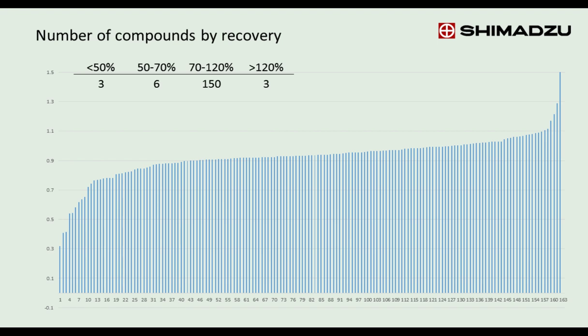Next, we show the recovery, and the recovery is important so that we know that we are not losing the analyte in the extraction process. And for nearly all the compounds, we have recovery between 70 and 120%.